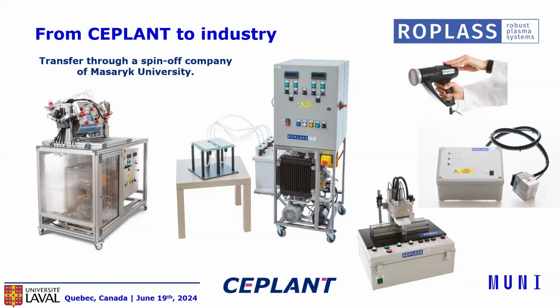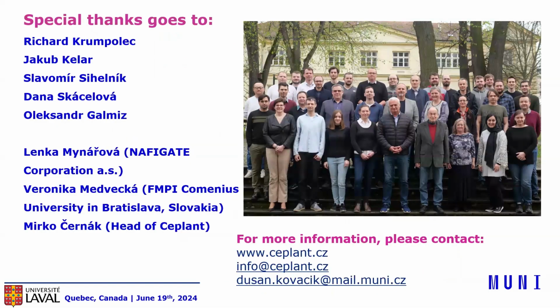They have the same property, plasma has the same property, but it's much, much smaller. Here you can see the so-called plasma gun, which generates plasma of 5 centimeters, 2 centimeters, but it is usually sufficient if you want to study some effect on the surface using XPS or scanning electron microscopy.